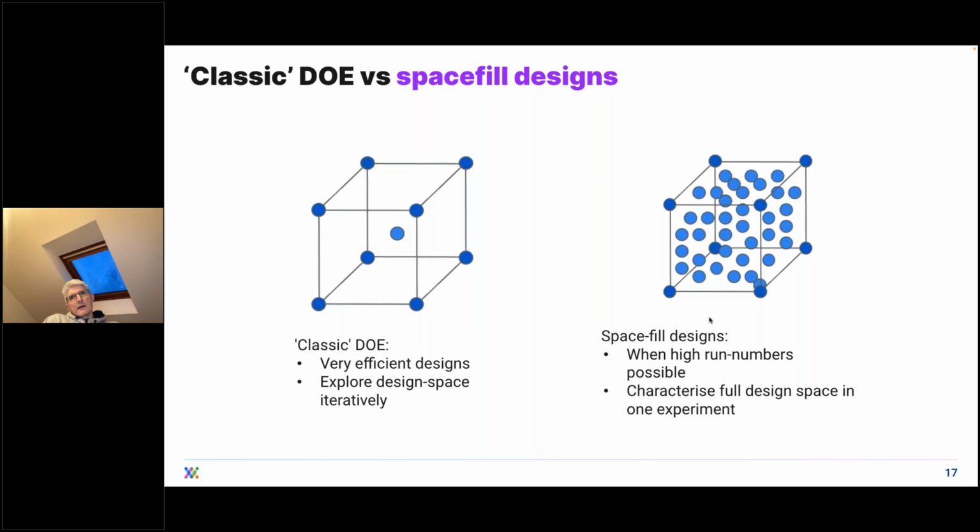But what's really interesting, and what we've found more recently at Synthace, and at a good number of our clients, is that where you can use a dispenser and where the biological system that you're working with can be scaled down, so typically into a 96, 384, or even a 1536 well plate, so these are very small volumes per experimental run, then you can all of a sudden get way more experimental runs than we would ever have used more classically. We've had clients who have run 1536 run experiments, and we ourselves have run experiments with many hundreds of design points.